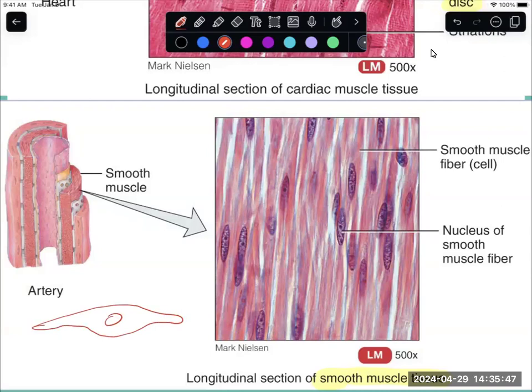So we see lots of nuclei found throughout, a lot of them, and they're large nuclei. You see lots of cells. Some start there, another one starts in the middle there, another one here. So you can see the difference. There are going to be more nuclei in smooth muscle, and you can usually somewhat see the outline shapes of cells here.